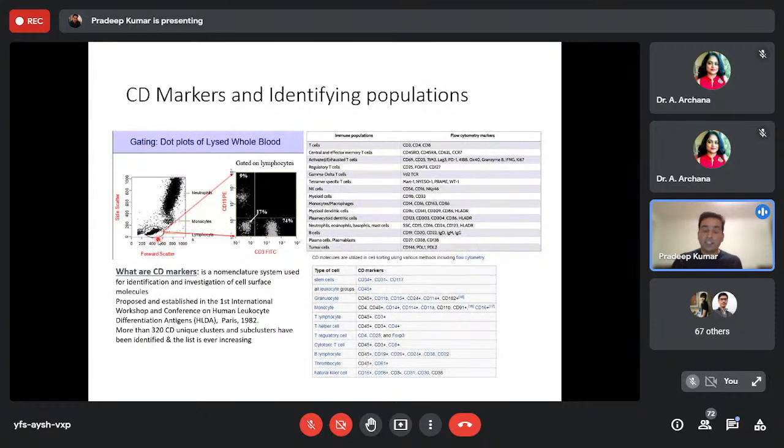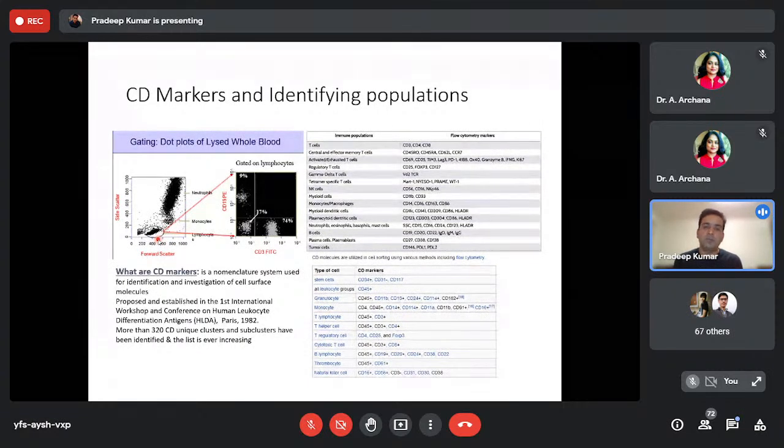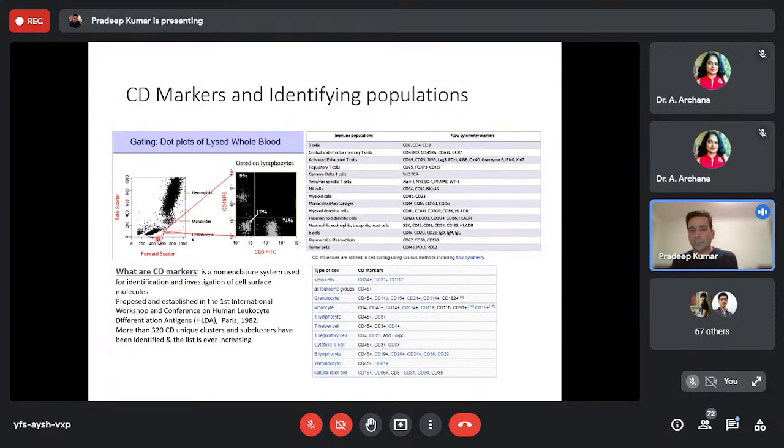Okay. And it is a pure quantitative technique. It doesn't tell you what happens to a patient, like in cancer diagnosis. It gives you information and statistics, and then based on the phenotyping and the knowledge and literature available, you tell what kind of disease is progressing.